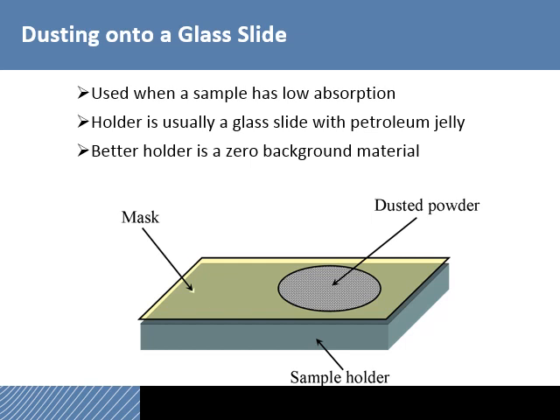What they do is they take the single crystal and cut it just off axis. That way there's nothing that would ever be in a reflecting or diffracting position from the silicon. They refer to it as a zero background holder. It's not really zero background, it's low background. But the benefit is that it doesn't have any diffracting planes, so it won't put any peaks in your pattern.